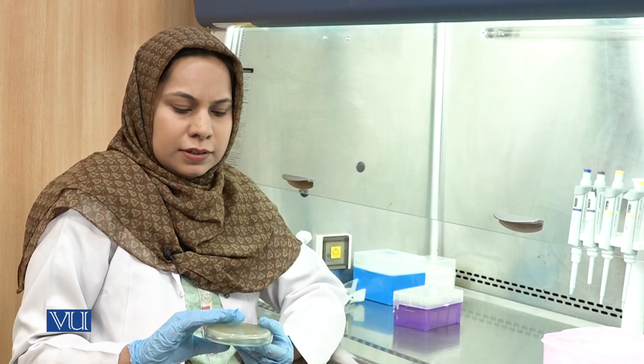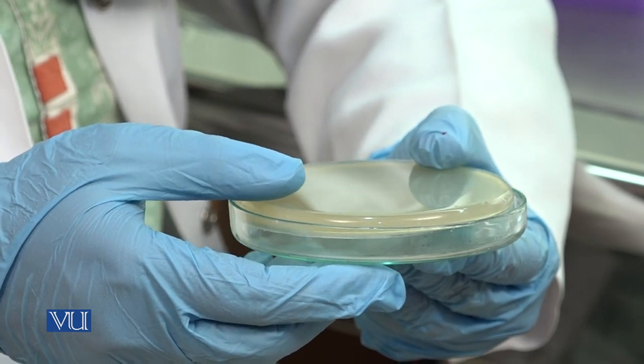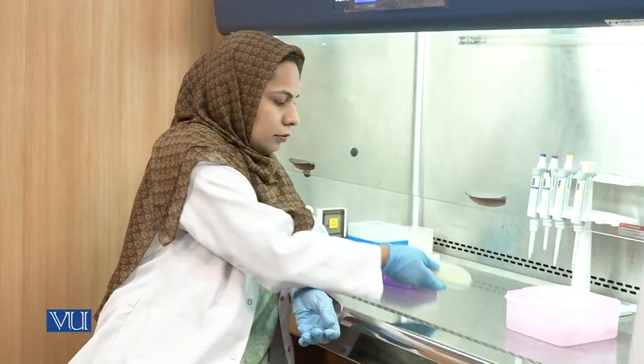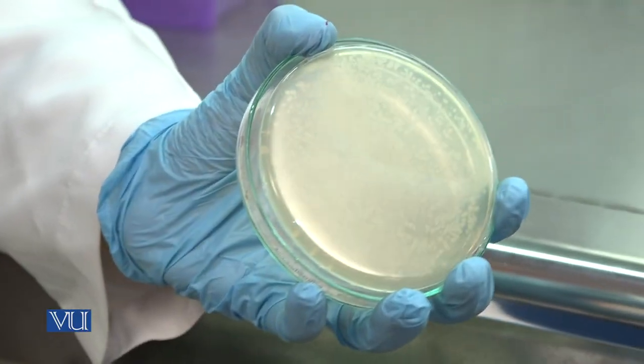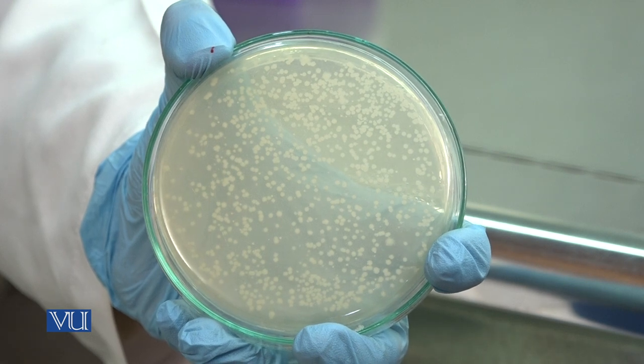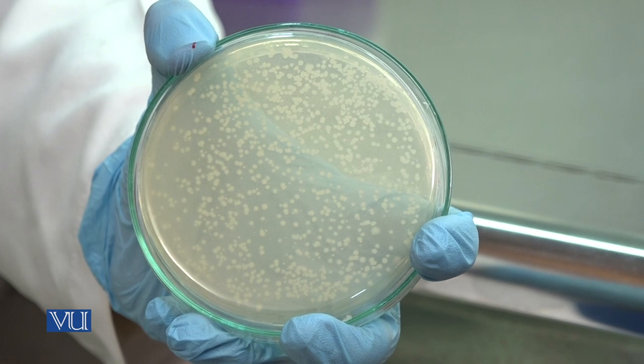After spreading 100 microliter of culture, this plate needs to be incubated at 37 degrees centigrade overnight. And after incubation, if your plasmid has been transformed, you will see colonies. After overnight incubation of bacterial culture, your colonies will appear like this if it has transformed plasmid.